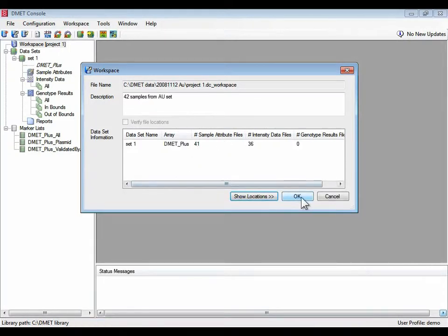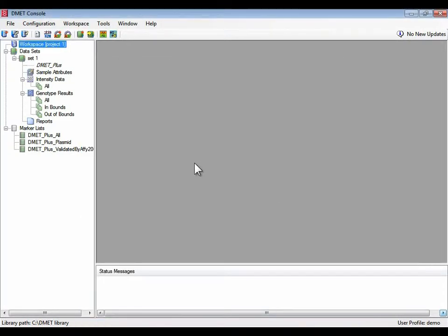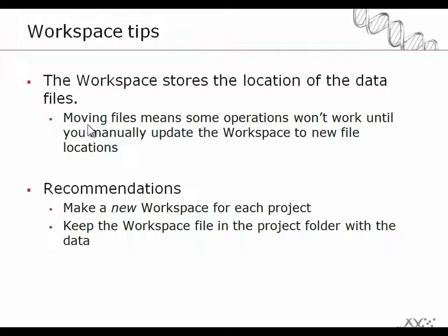Sample attribute files, intensity files. The more files that are managed by the software, the more likely it is that when files get moved, you're going to have a problem. Therefore, we have some recommendations. The basic recommendation is that for each project or logical set of data, you create a new workspace file and save the workspace file in the project folder along with the data, so that when the folder gets moved, the workspace file moves with it. It'll make it easier to update the paths should you want to use that workspace file again.